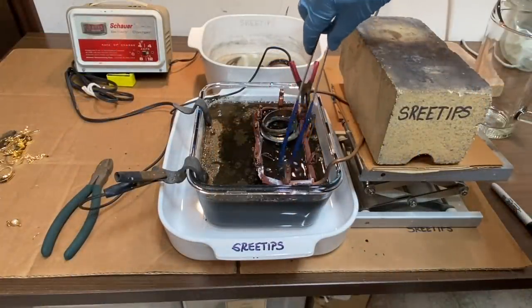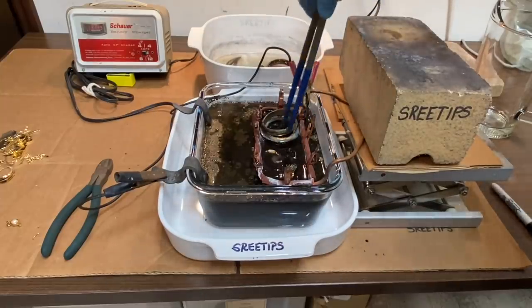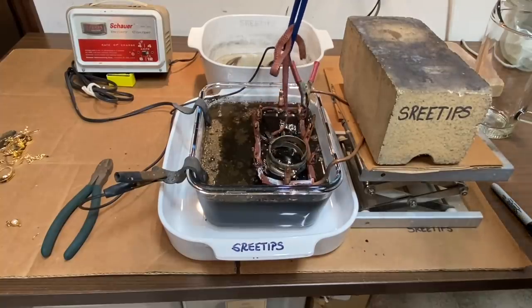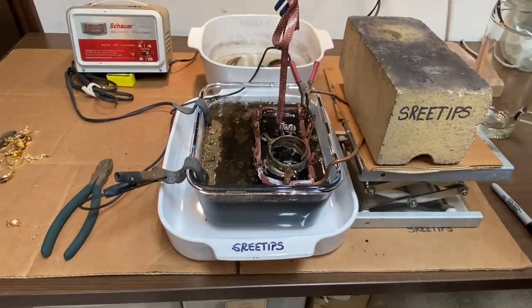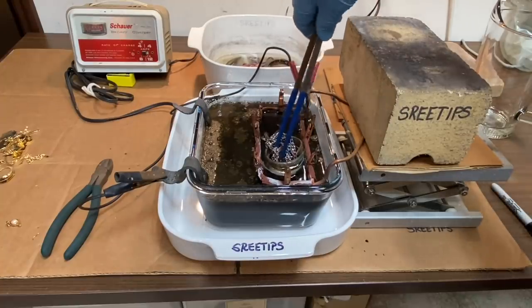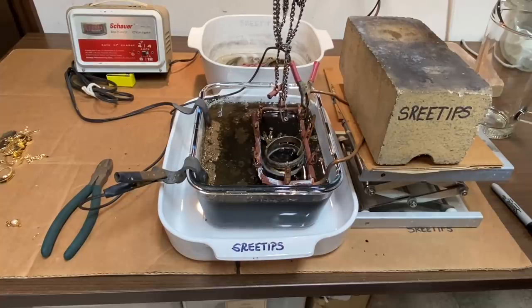One of the questions in the comments section was: could I just leave the basket in place and remove the material as it becomes deplated? The answer is, I'm doing it right here. It can be done, but as you can see there's stuff dripping off. If I raise the basket up and let it drip out, then I don't have that going on. But yes, you can pull the material out while the basket is in the electrolyte.